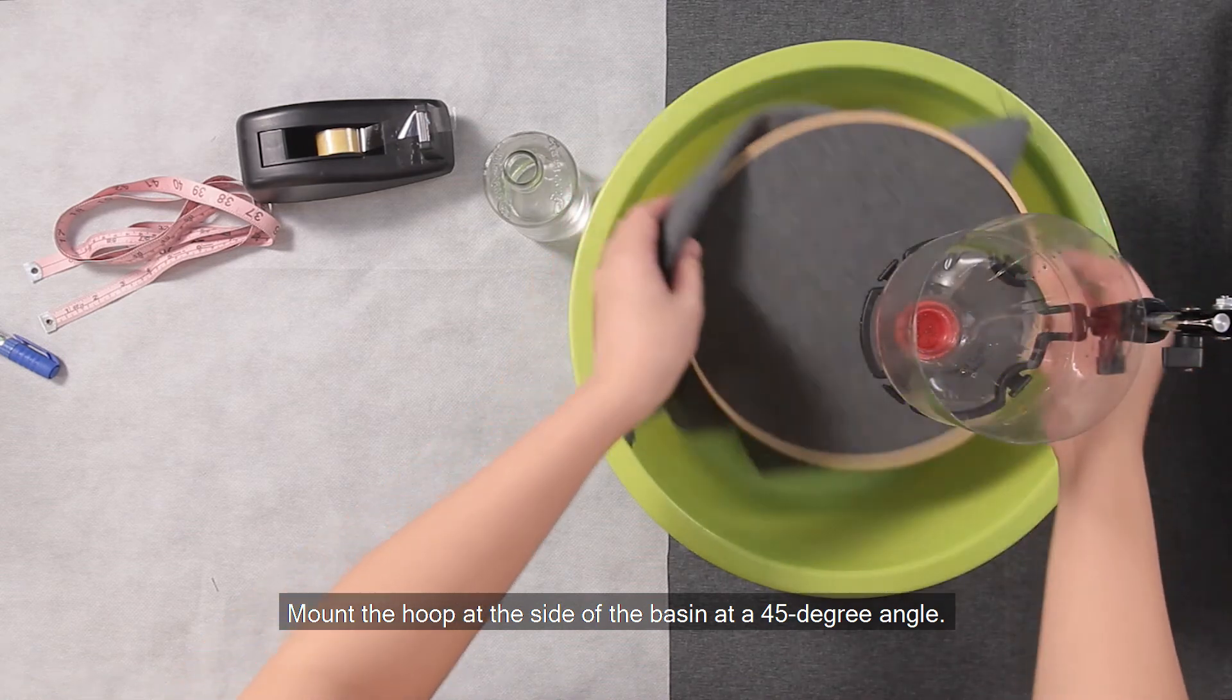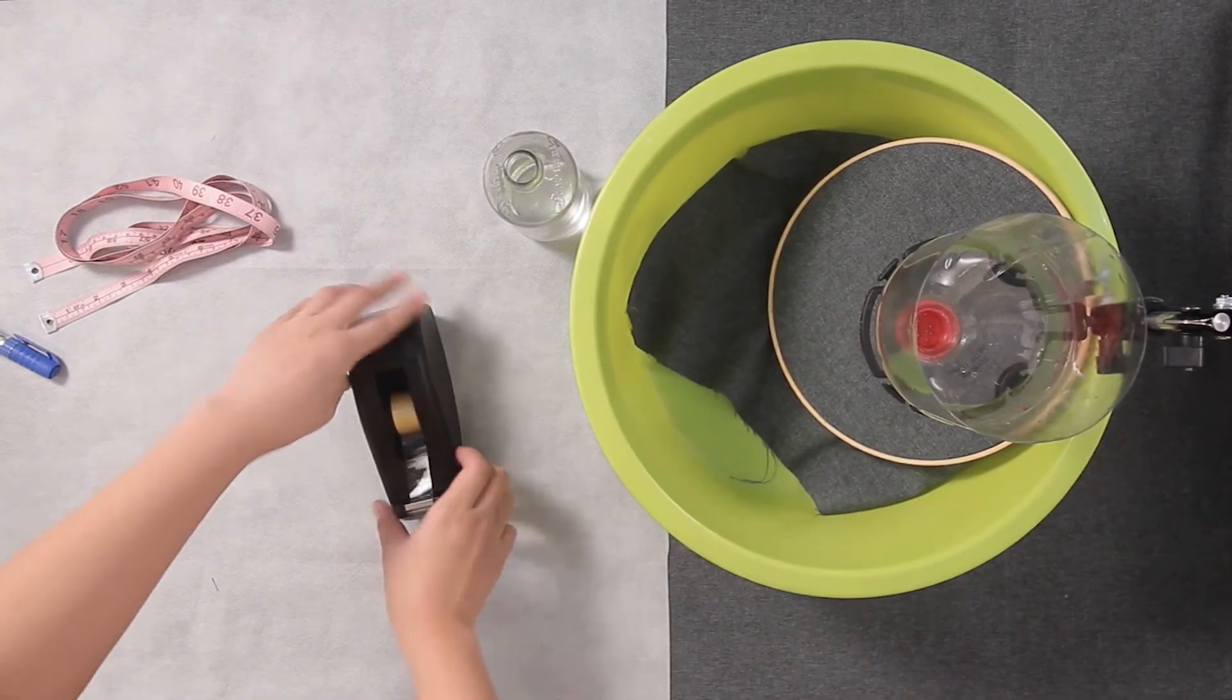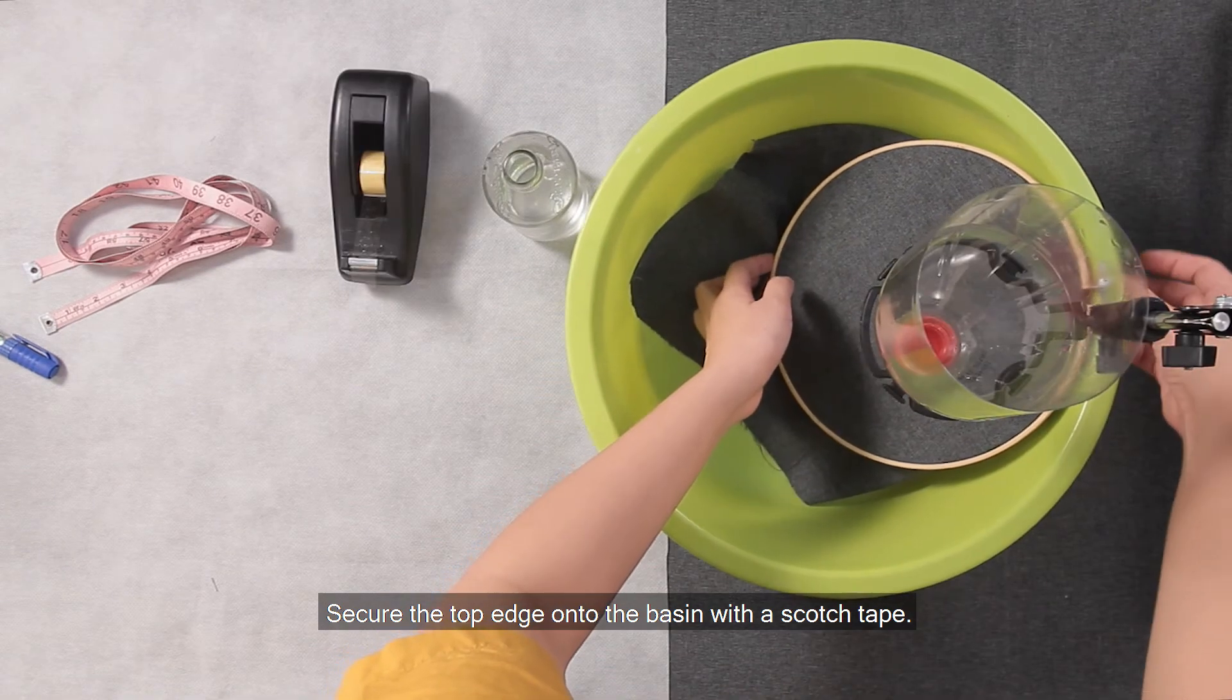Mount the hoop at the side of the basin at a 45-degree angle. Secure the top edge onto the basin with scotch tape.